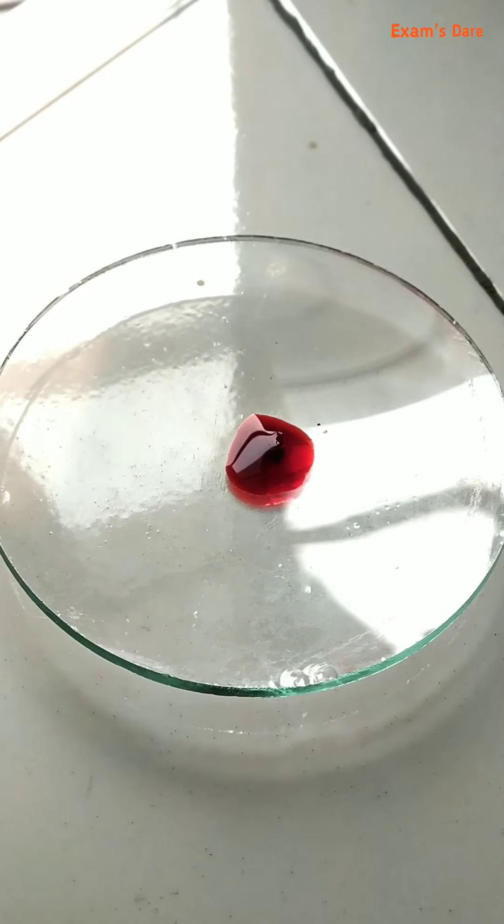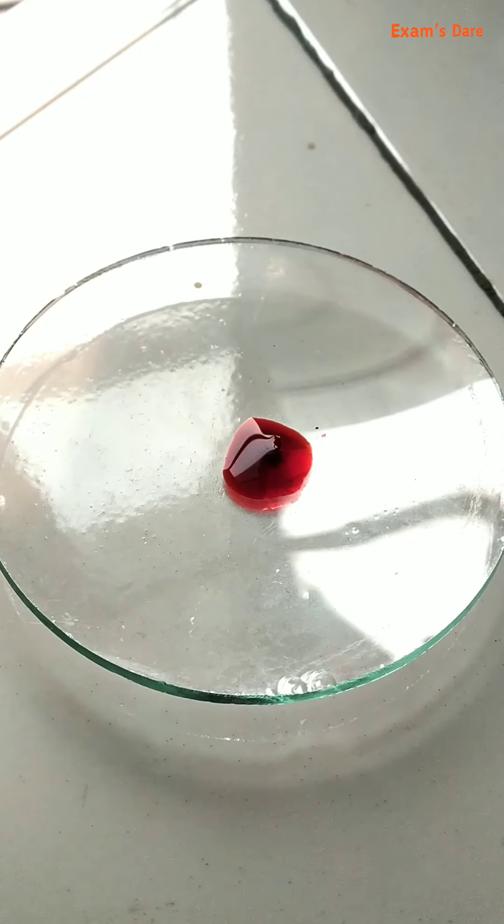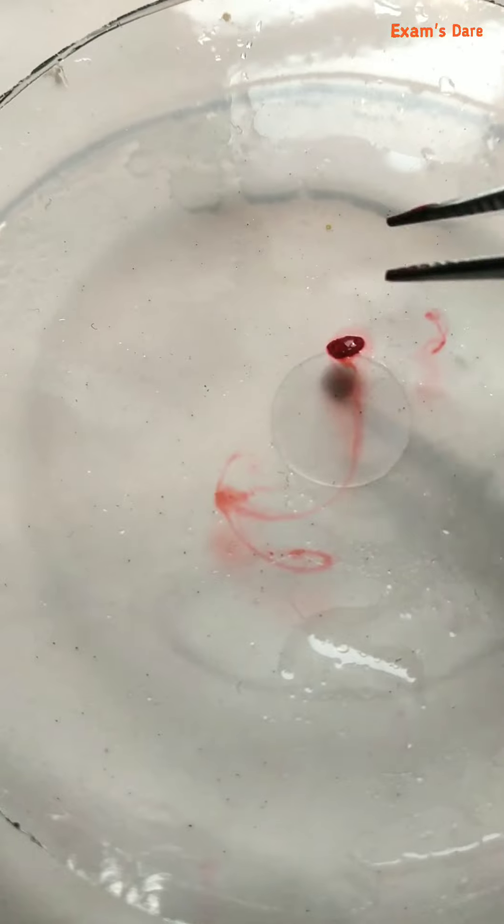Now pick up the section and transfer it to a watch glass containing plain water.